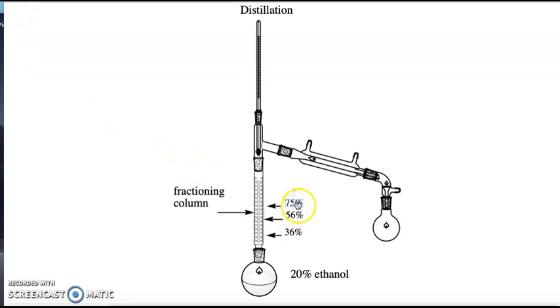Evaporation condensation cycle happens again, and now it's 75%, and we keep repeating this like we did, so that by the time we reach our condenser, we've done multiple rounds of evaporations, and maybe our product is 88% pure now, or maybe even more. This is a fairly long column, so we'd probably get more than just these 5 cycles going on. But you get the idea. Every time it evaporates and condenses, we get purification of our liquids. We get enriched in the more volatile compound.